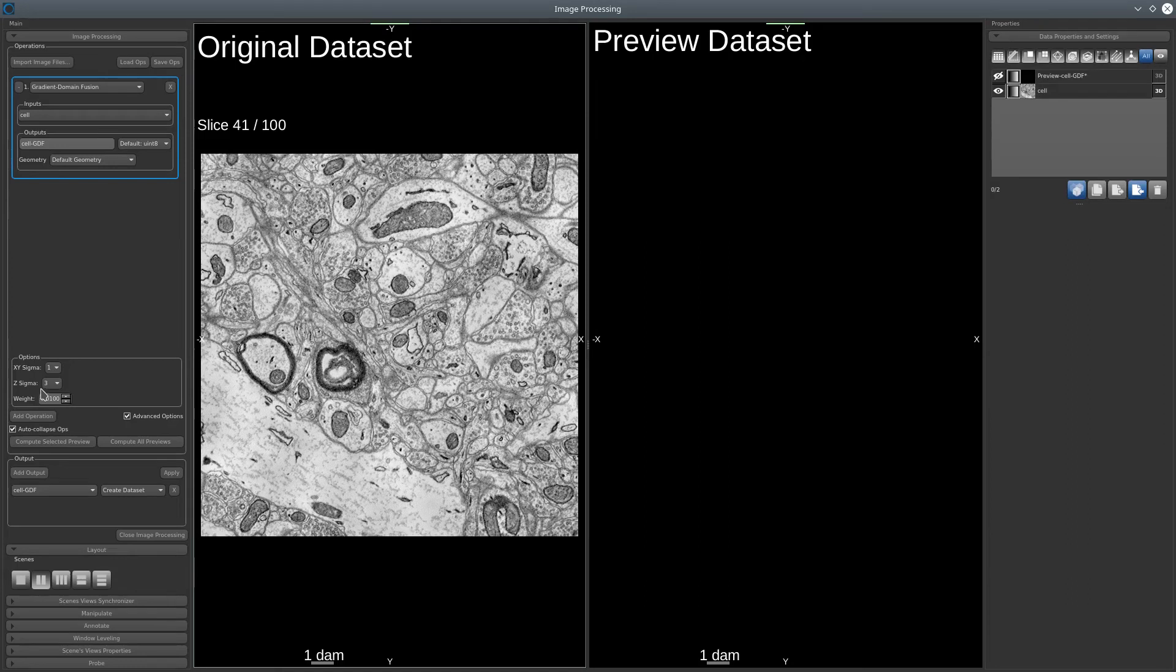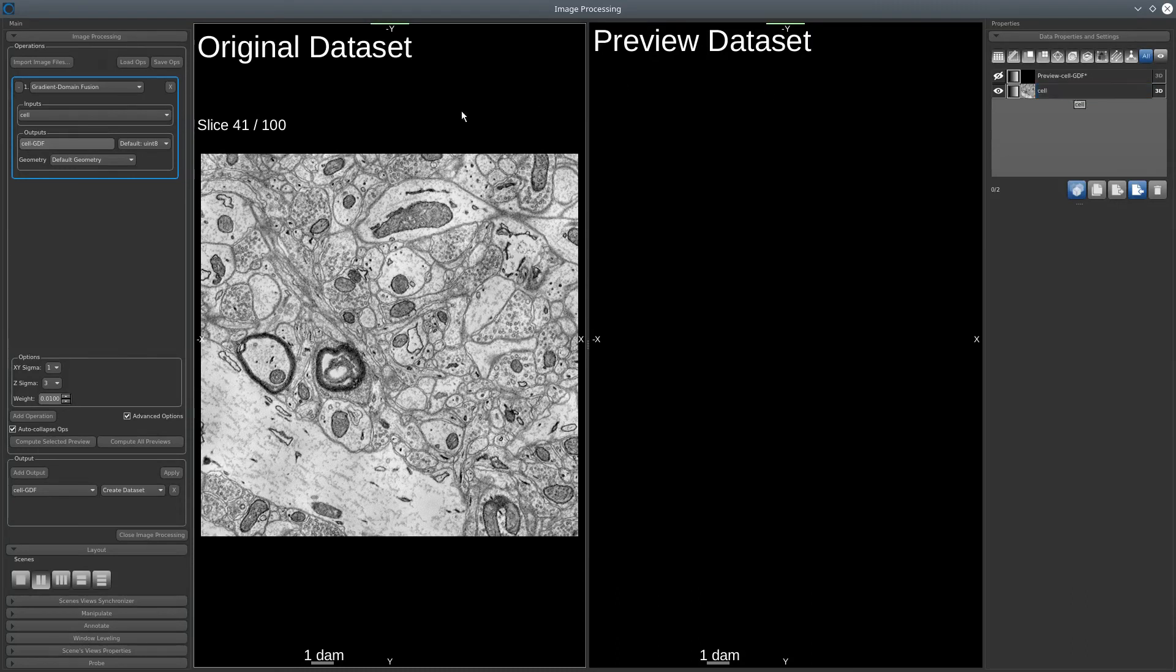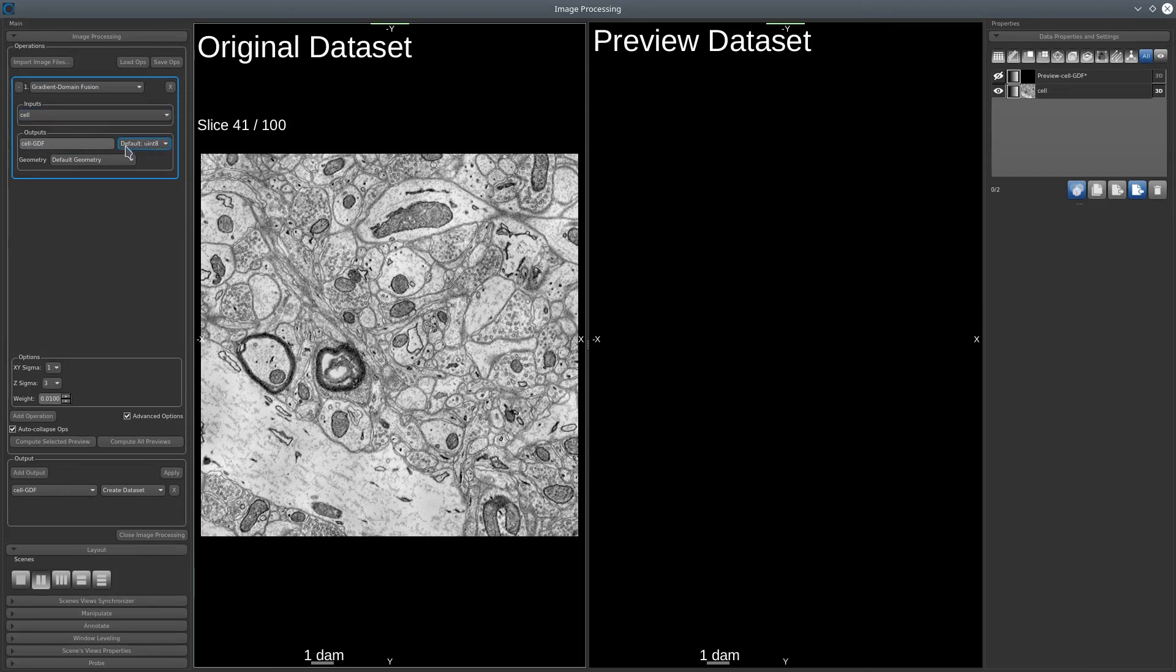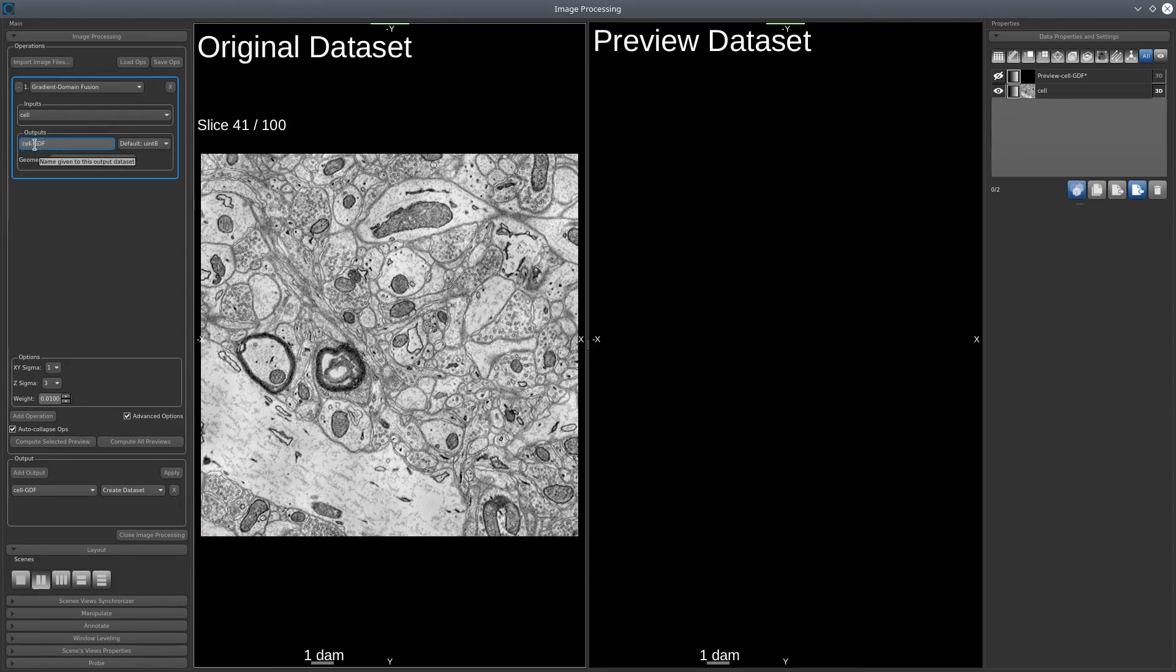Since we only have one data, the input is itself. But if you have many data set or ROI, it's very important to select the right one. Here will be the name of the output, the corrected dataset. For now, I will just leave it like that. GDF as gradient domain fusion, but you can put anything that is meaningful for you.